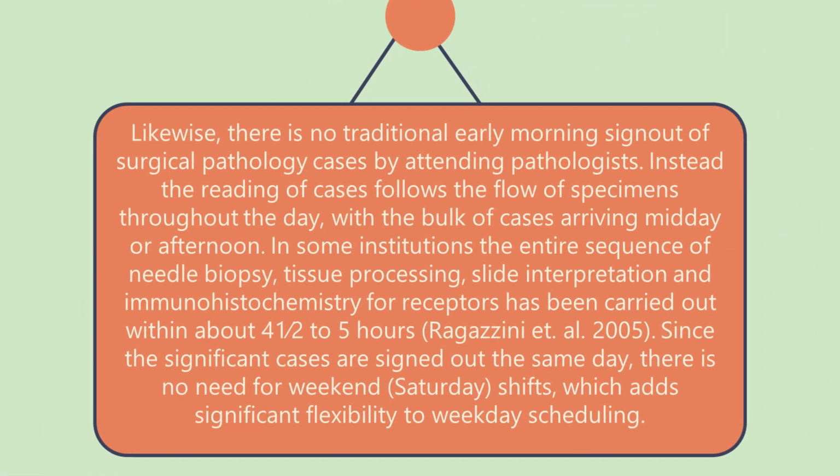So of course, there are also no traditional early morning sign-outs of the surgical pathology cases by the attending pathologist. Instead, the reading of the cases follows the flow of the specimens throughout the day, with the bulk of cases arriving at midday or afternoon. In some institutions, the entire sequence of needle biopsy, tissue processing, slide interpretation, and immunohistochemistry for receptors has been carried out within about 4.5 to 5 hours.